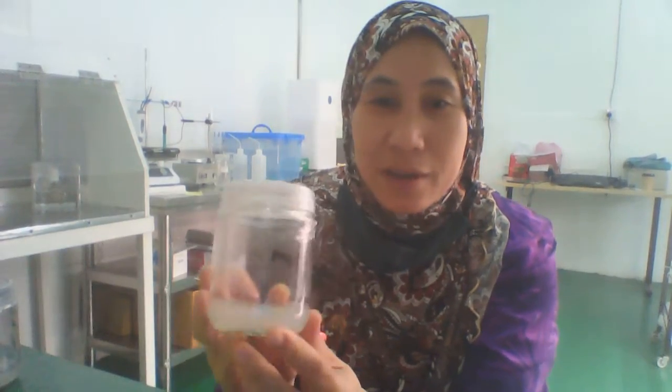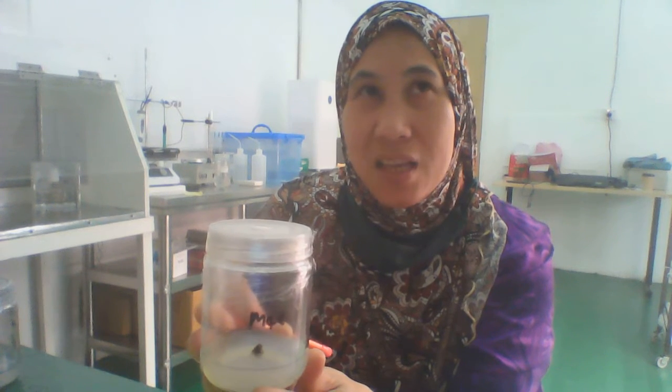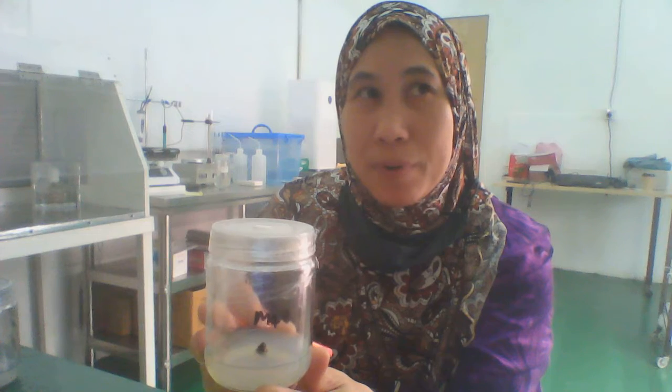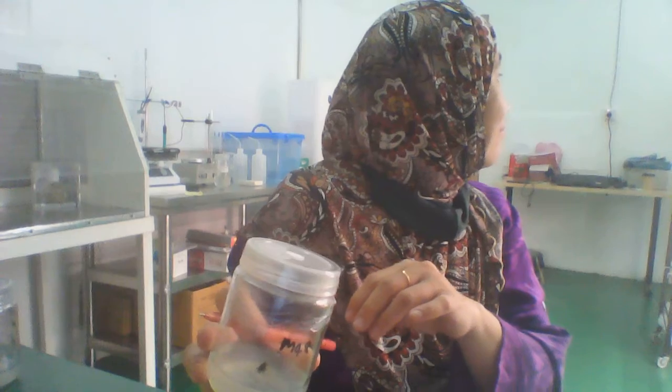This is the failure, but I try to see my luck. This is actually Piper ornatum. Okay, this is Piper ornatum, or Indonesian bitter leaf, or sirih merah Indonesia. And this is a failure for me, but I just want to try my luck. For the first culture, I put it in a media with ppm.